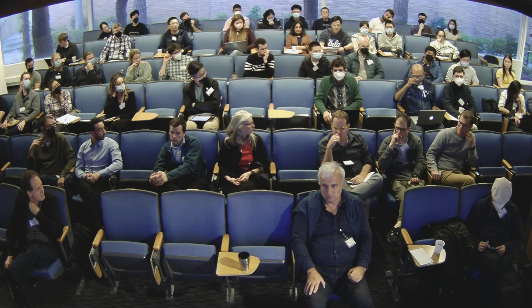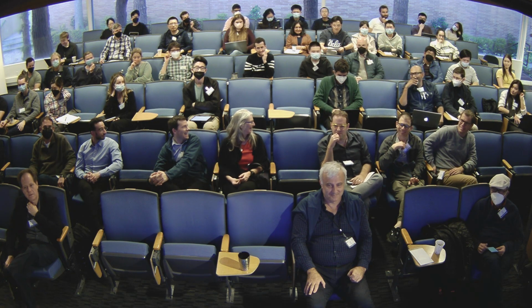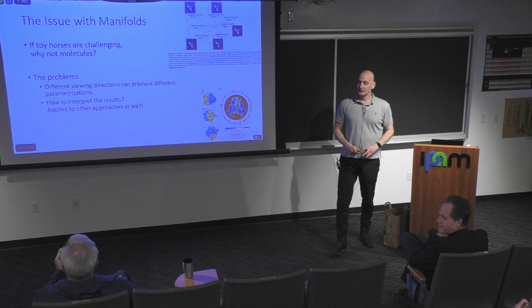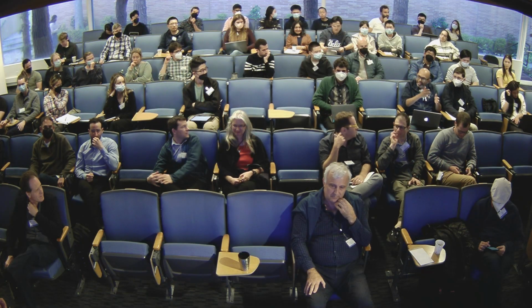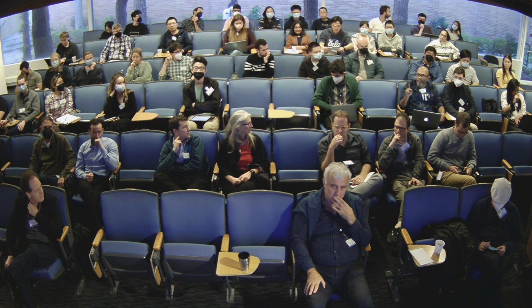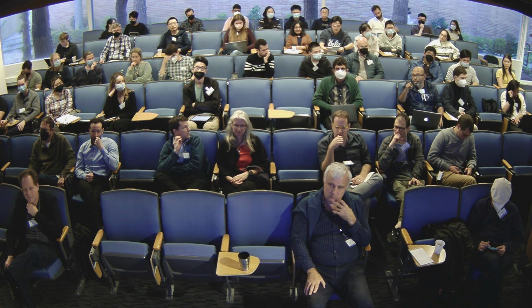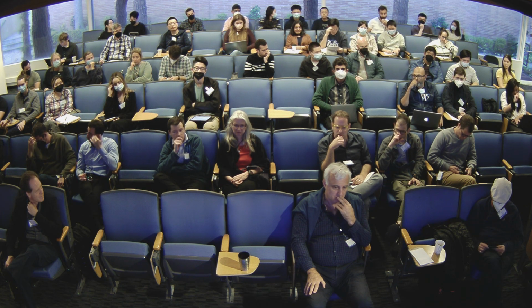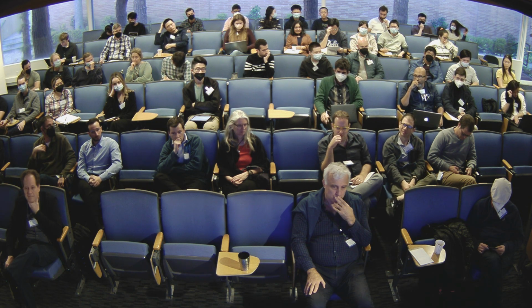Let me, as an author of that paper, counter. It's not about that paper. I'm saying there's a lot that's been done to address this, right? No, that's correct, and thanks for telling that, because it's true. This orientation has been a problem, and so an orientation-dependent metric should not be taken. Something like a distance metric would be a better idea, where the orientation of the particles itself does not come into play. So that problem is addressed. Now, the interpretation of the landscapes that you mentioned, that is questionable, and that, of course, depends on the domain.